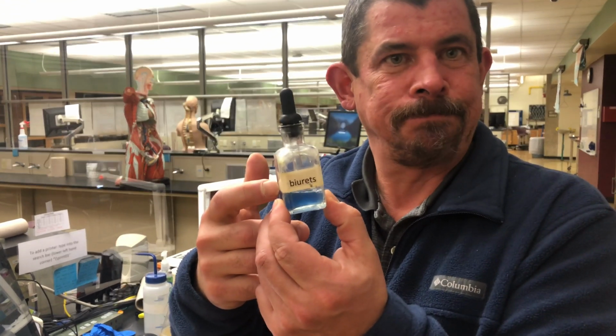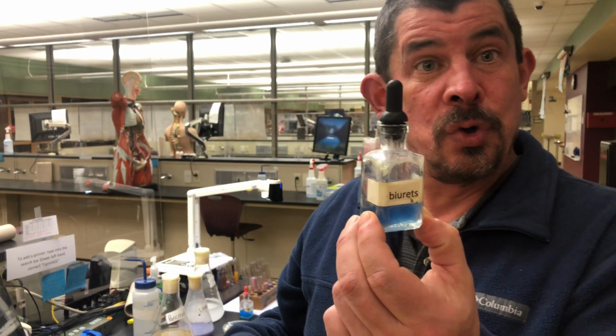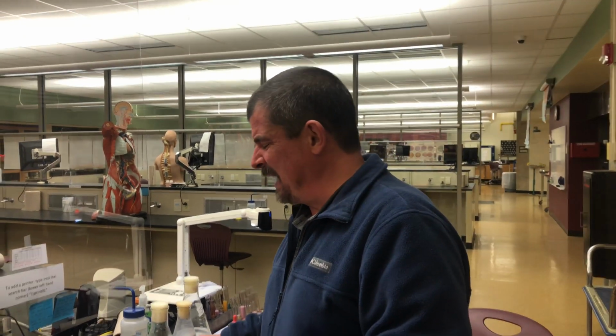The Biuret solution is an indicator for protein. So we're going to add Biuret's to both the test tube with the egg whites in the water and the egg whites in the pancreatin. If you continue reading, we're going to have 2 possible color changes. We're either going to have a pink or a purple color change. The pink color change indicates that protein digestion has occurred. A purple color indicates that protein is present, which would make sense.